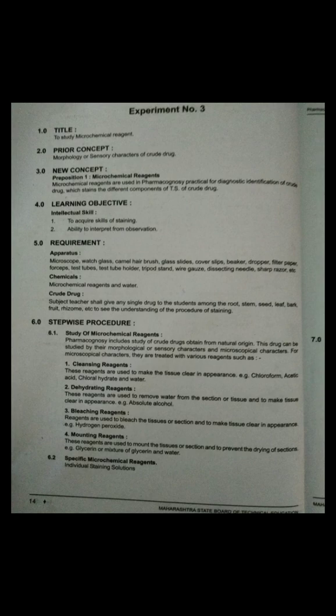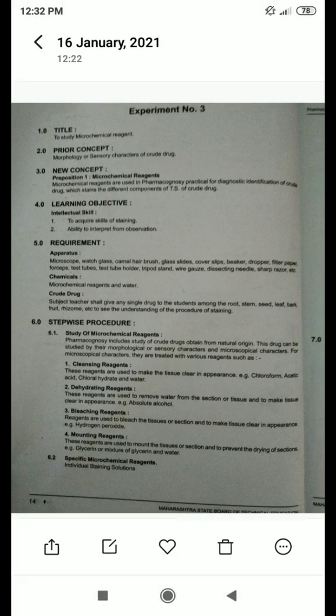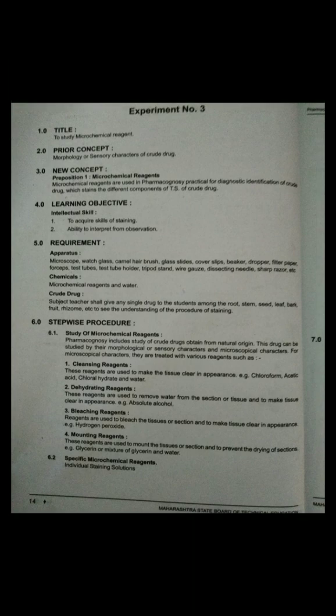Then dehydrating reagents. These reagents are used to remove the water from the section or tissue and to make the tissue clear in appearance. For example, absolute alcohol. These are the dehydrating reagents.